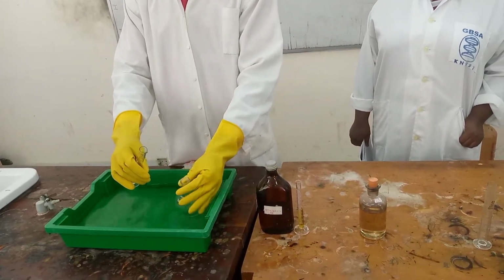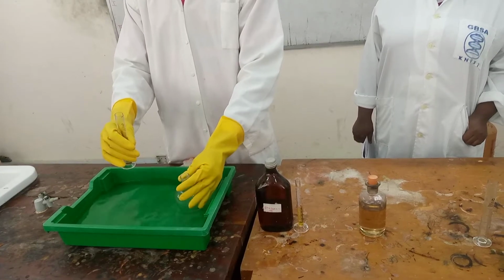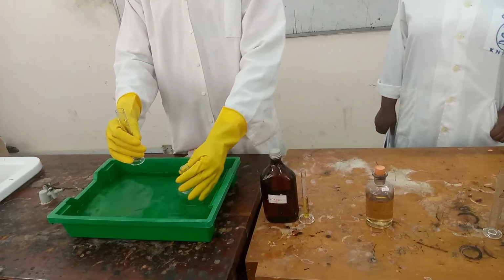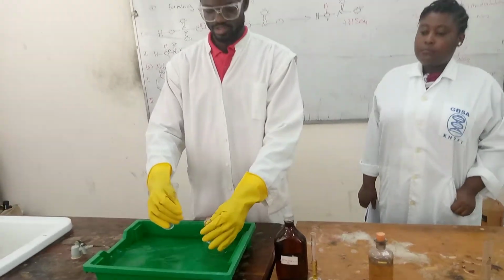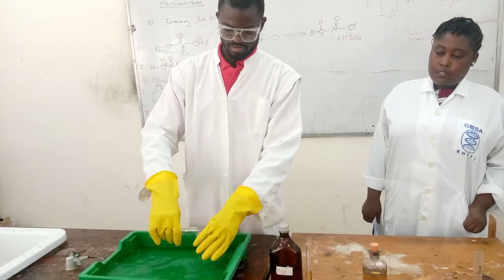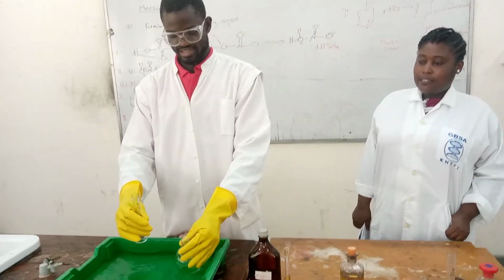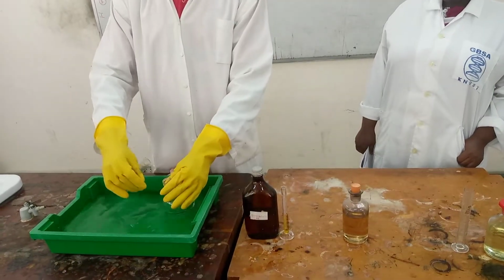Wow, you can see. Theoretically, the nitric acid is deprotonating the sulfuric acid to form the nitro group. Wonderful, as you can see. I can see the fumes.